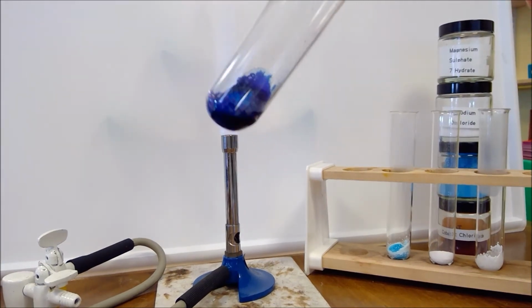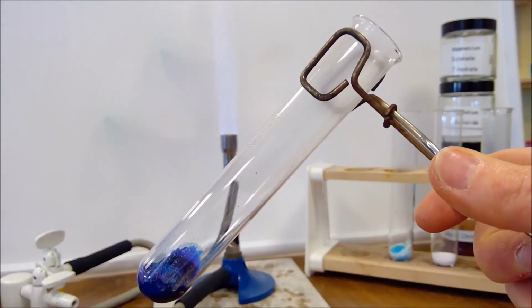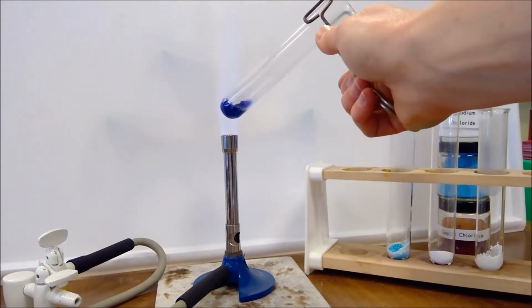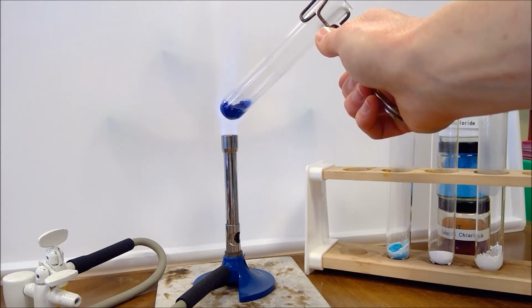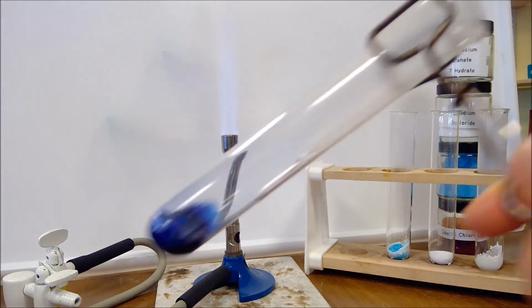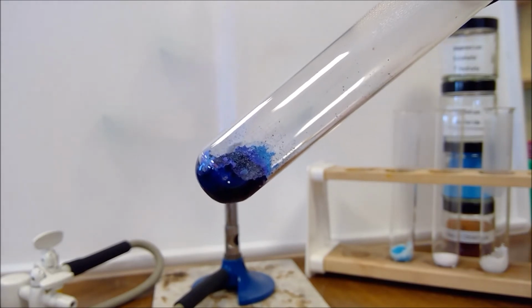And then look at that change in colour as well. So around the top, lots of condensation, and the colour change at the bottom.